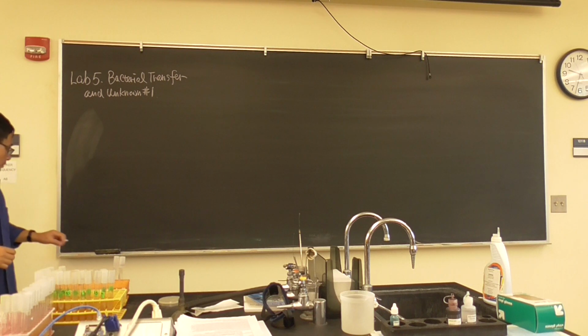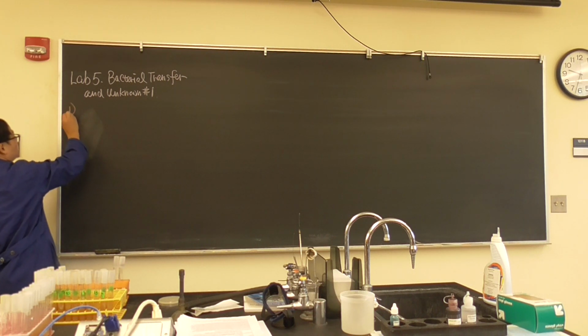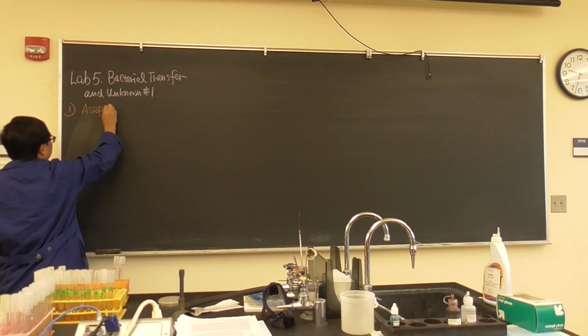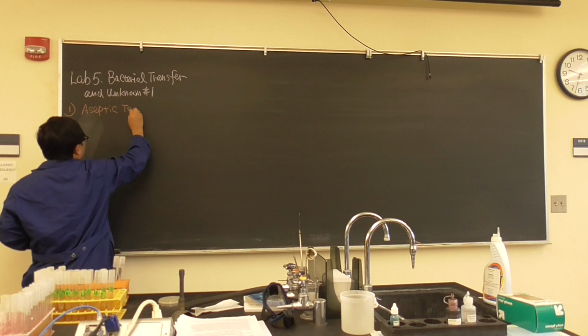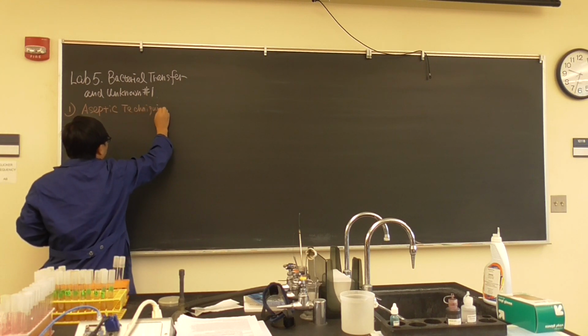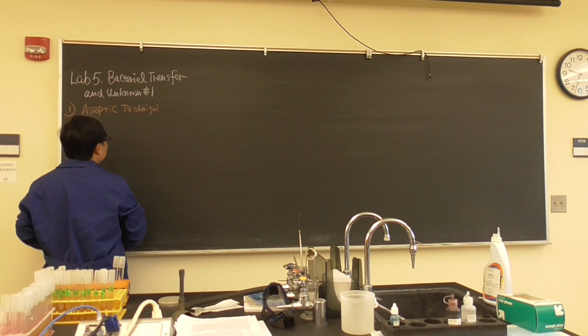Before we talk about bacterial transfer, there is one concept we wanted to introduce to you called the aseptic technique. What does aseptic technique mean?